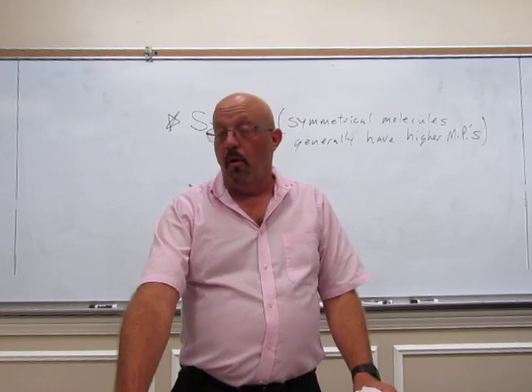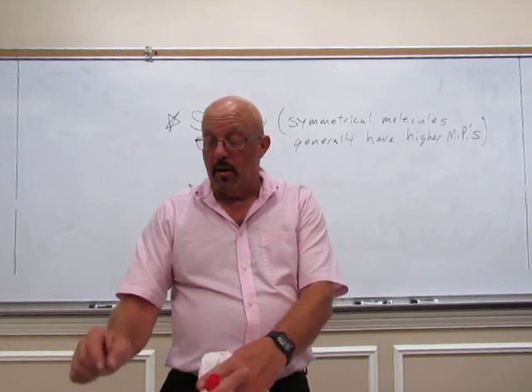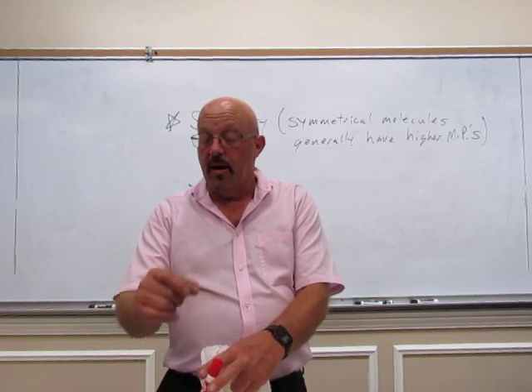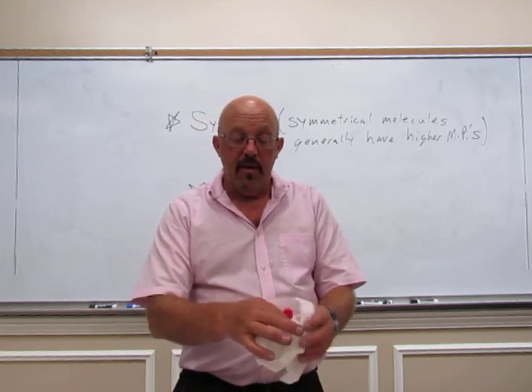You can let it sit there and boil forever. It's not going to, no more is going to dissolve. If it's not dissolved at boiling, add a little bit more solvent. Get it back to boiling. Still not all dissolved, add another couple drops of solvent. Get it back to boiling. You keep going until it's just dissolved and then stop. Take it off the heat.